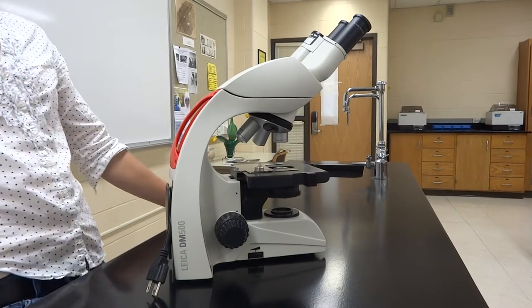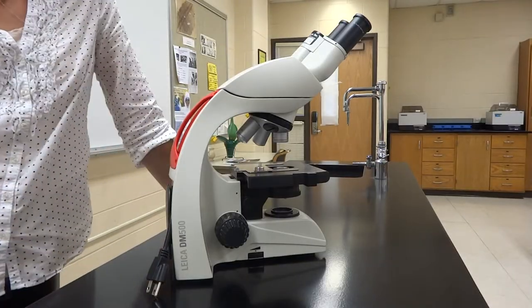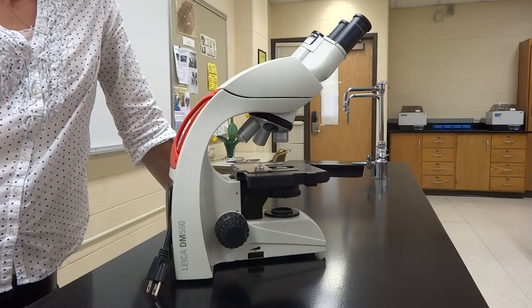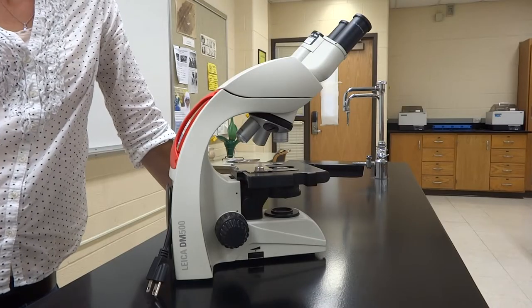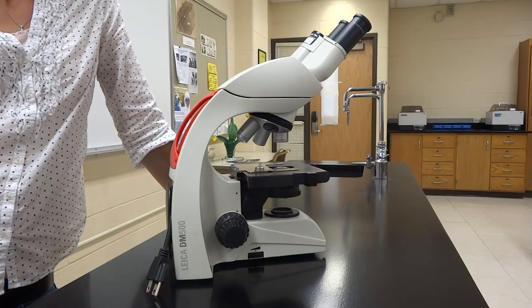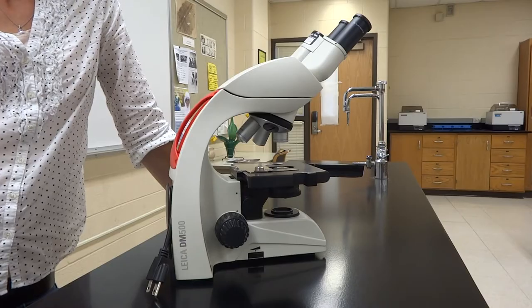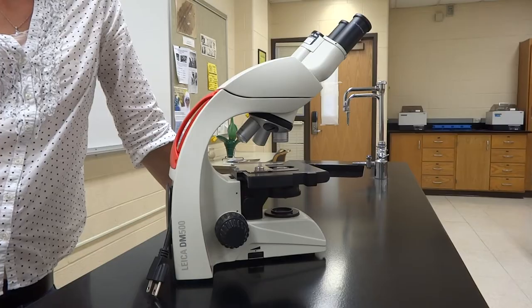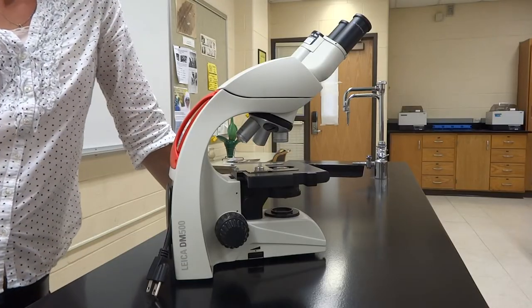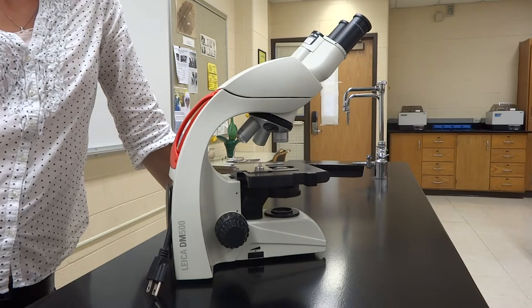Welcome to our microscope overview. This is technically the second thing you get to play with coming up in a couple weeks, and you will have one scope that is yours the whole semester. That means you need to know what it does and how to take care of it, because points get taken off when scopes are put away wrong — these are mildly expensive pieces of equipment.